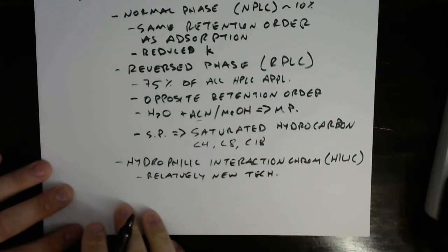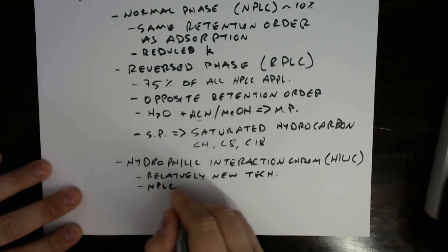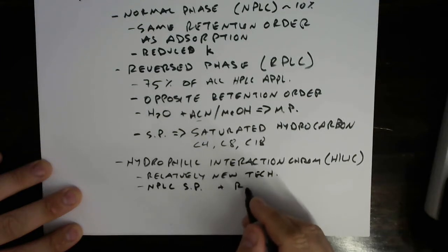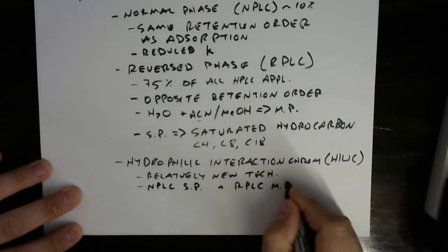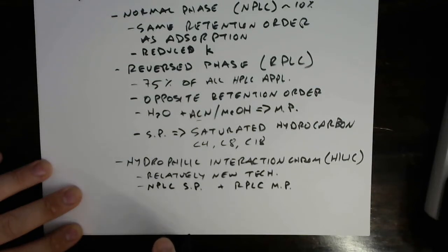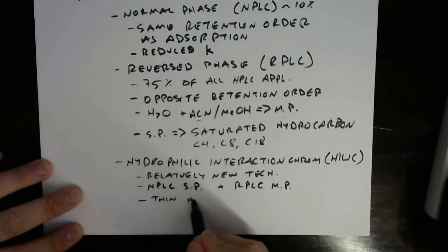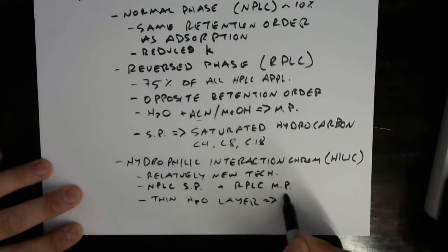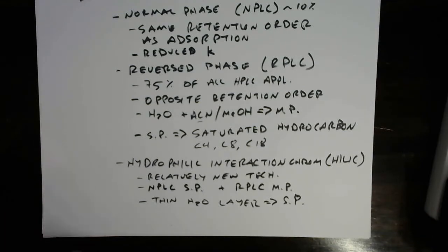And the hallmark, the way I like to think about this, is that it's normal phase stationary phases plus reverse phase, RPLC, mobile phases. And this results in a thin water layer that plays a role in the stationary phase. Okay, those were our modes.